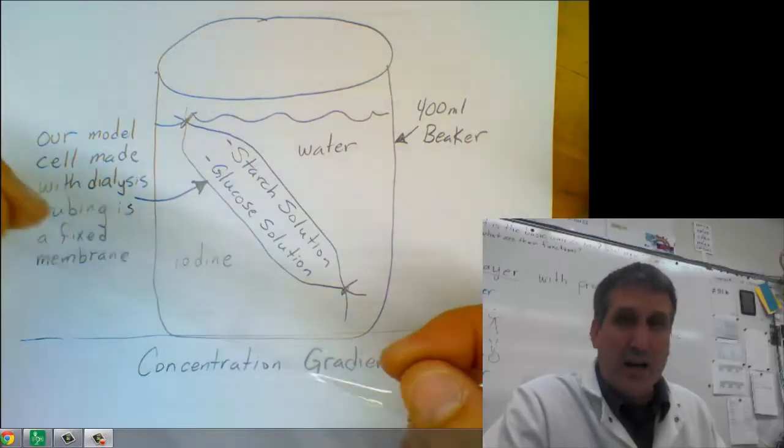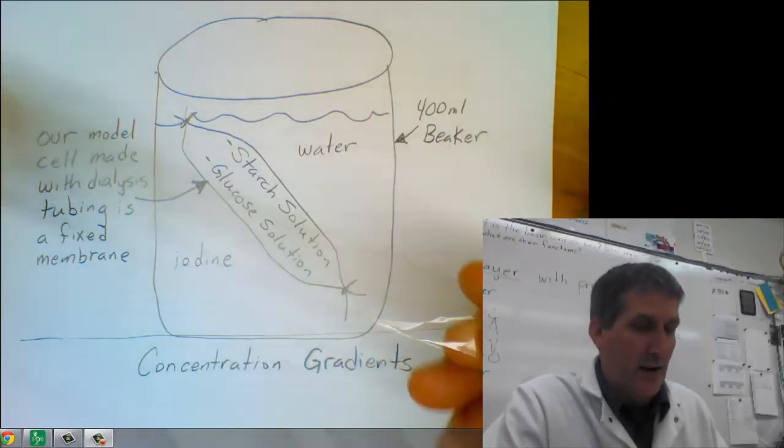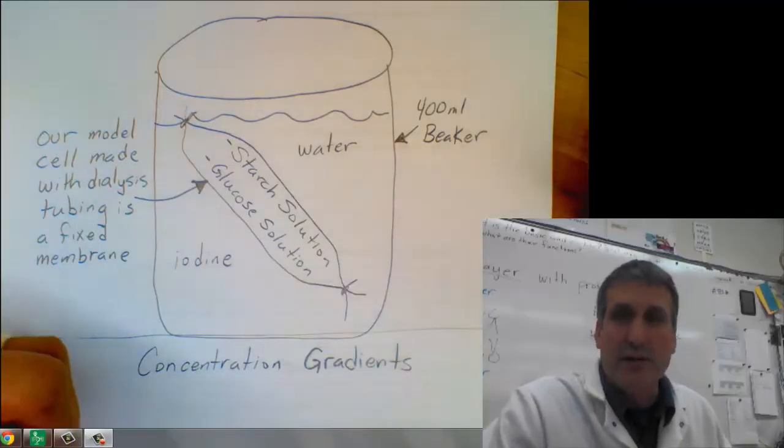So now we're going to move into the back and we're going to talk about how you're going to actually open up this dialysis tubing and prepare your setup.